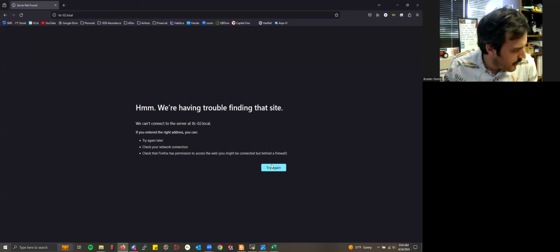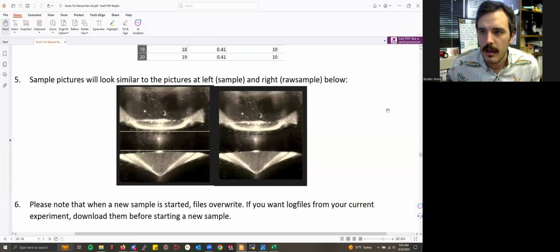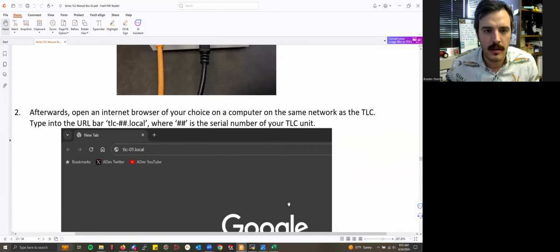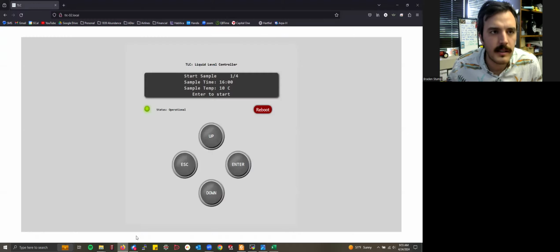I think I might have something a little bit wrong here. One moment, I'll check the user manual. All of this is happening live, folks. So yeah, if you're on the same network as the TLC, you should be able to type in TLC-number.local, where number is the serial number of your TLC unit. Let's take a peek and see if it works this time. Oh, popped open. Sorry about that. Just got to wait for it to load a little bit.